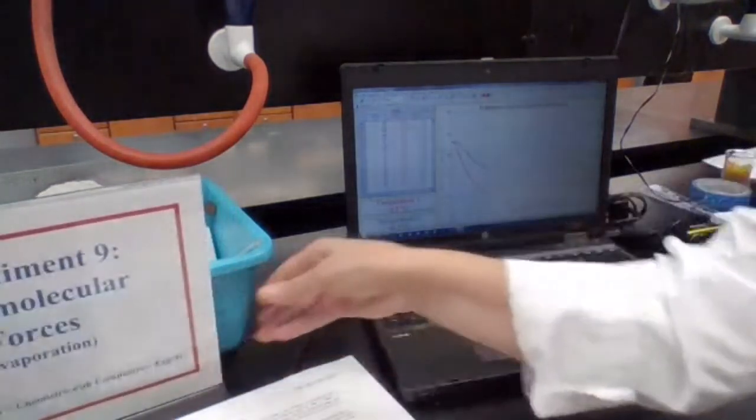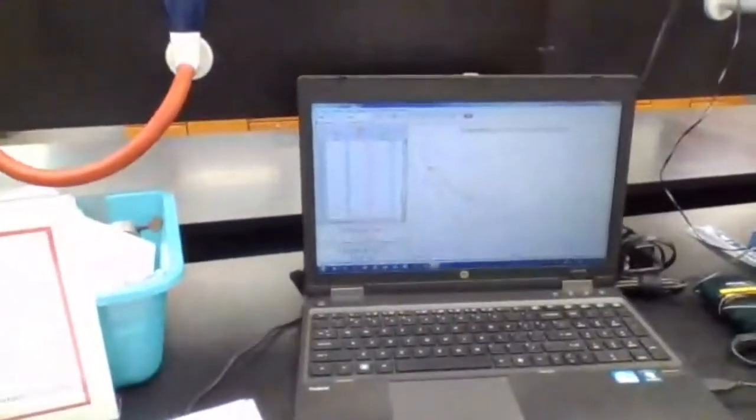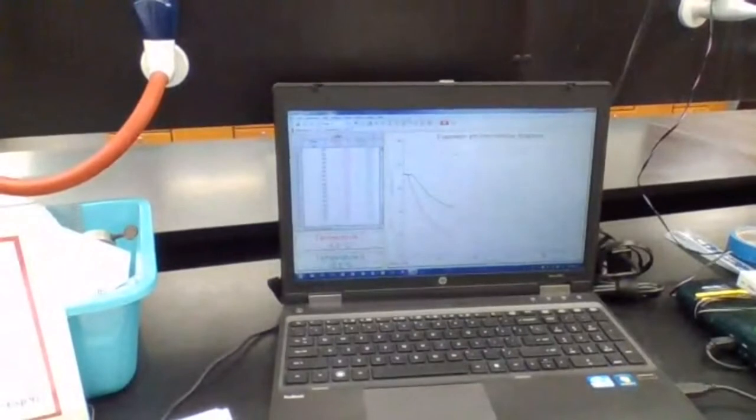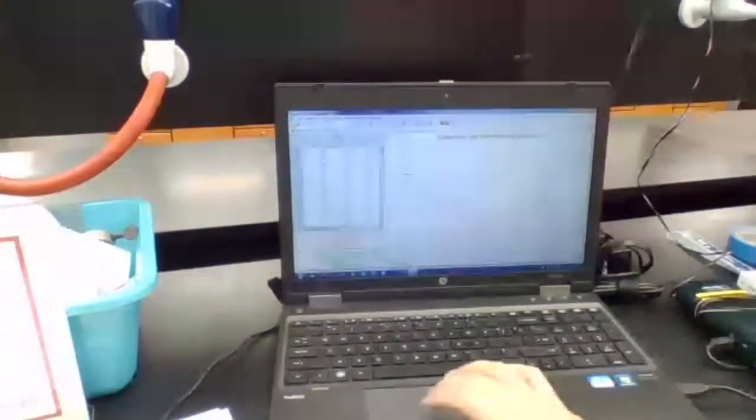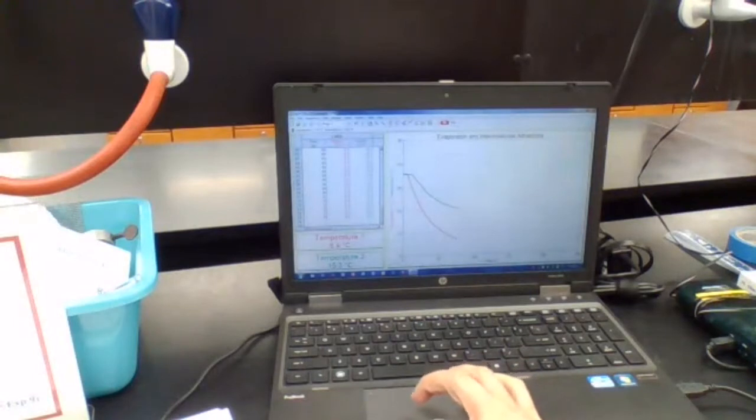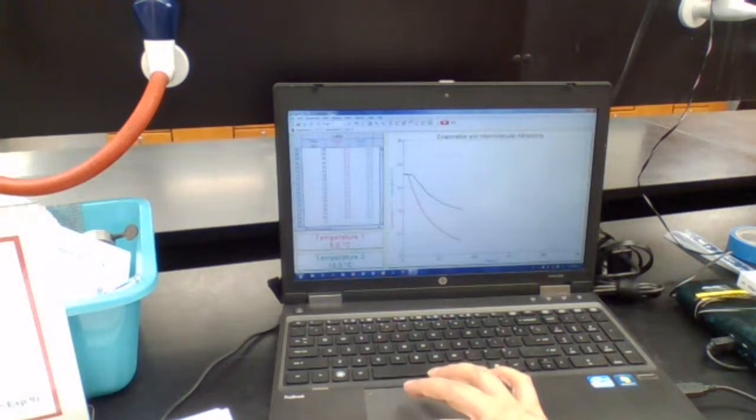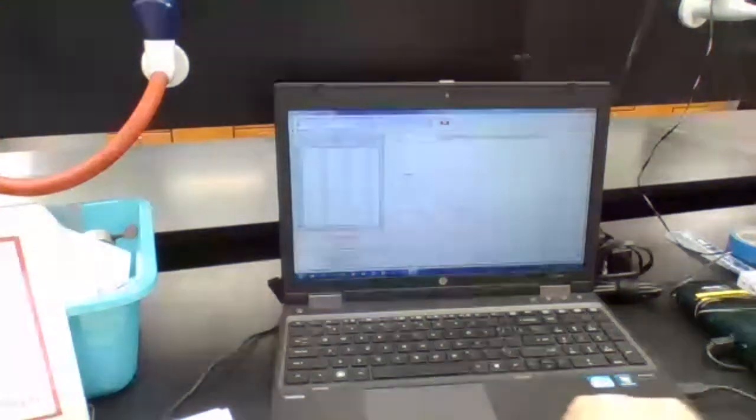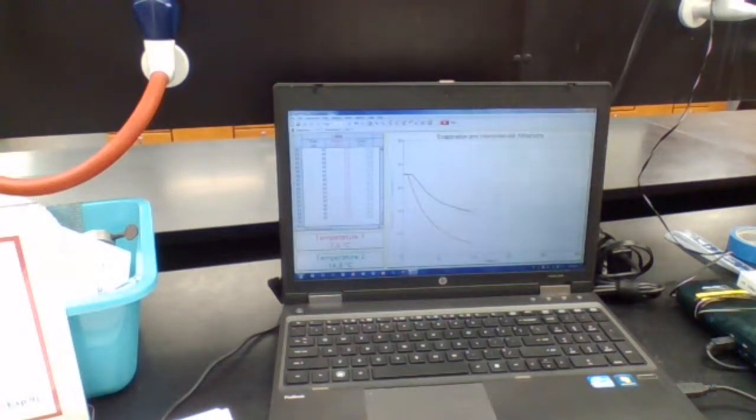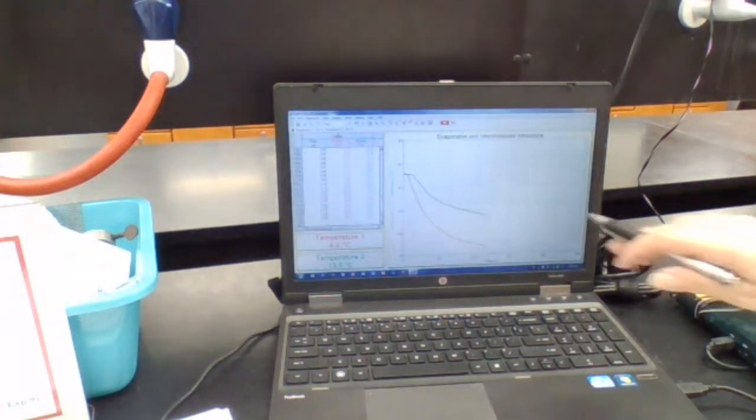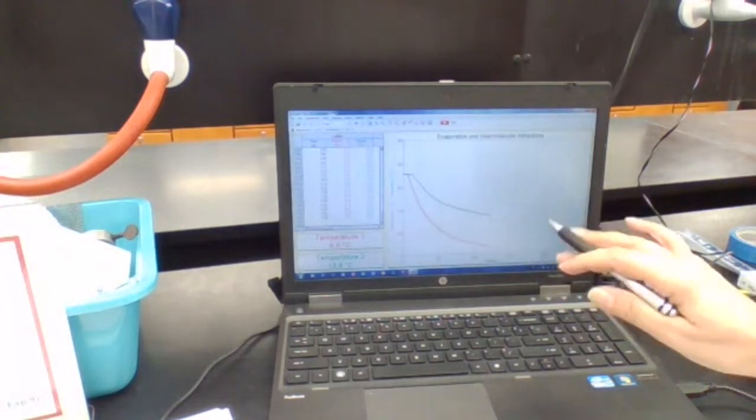Don't know how to minimize the reflection. You could see the paper, the computer screen better. The highest temperature we had here, the temperature we start with, is 23 for both of them.